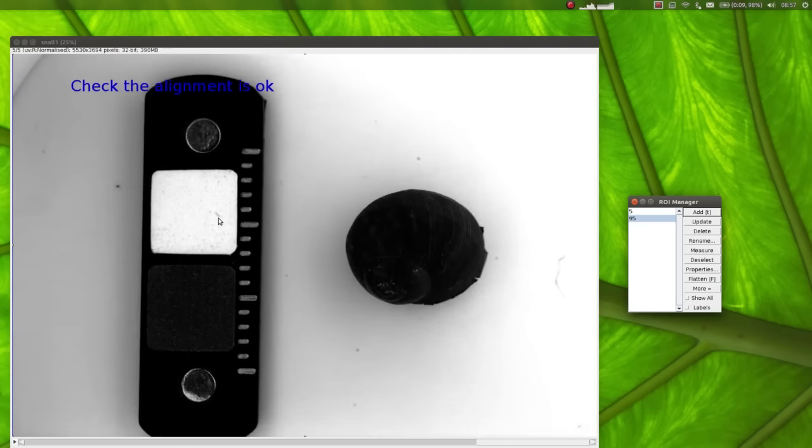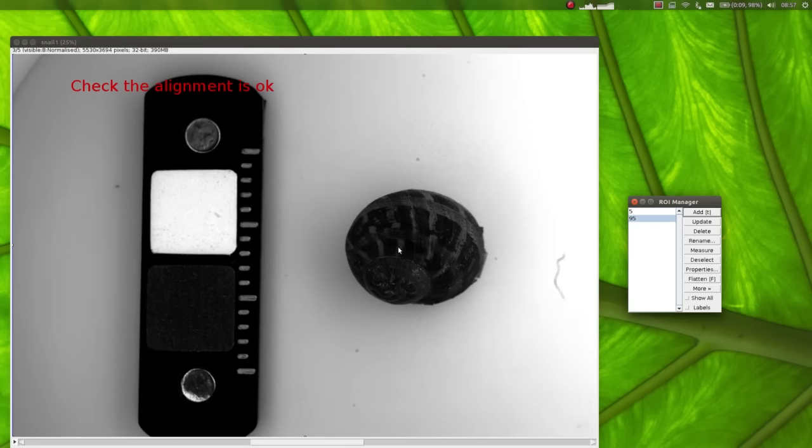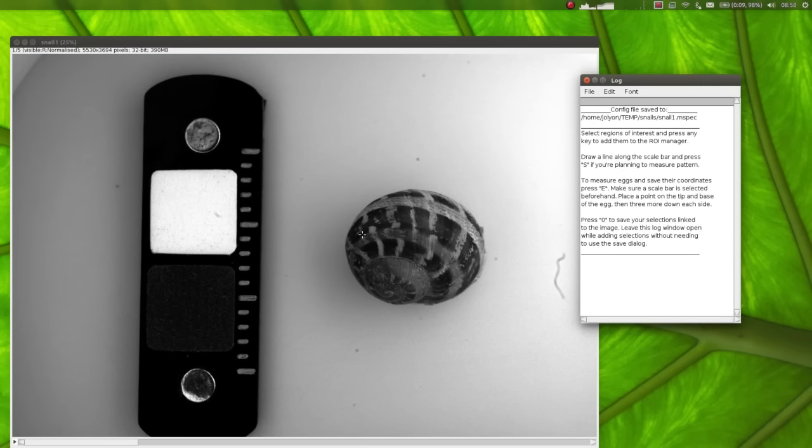Now check that the alignment is okay. So I'm interested in making sure that there is good alignment between the UV and visible image for the snail here. So it just flips back and forth a few times to allow you to check that it's worked nicely.